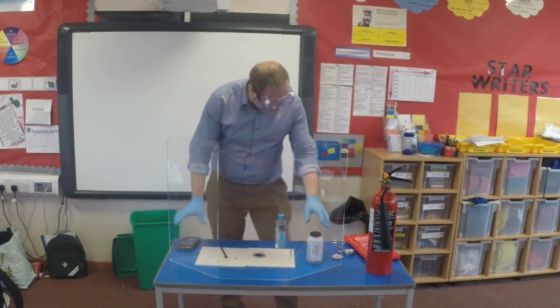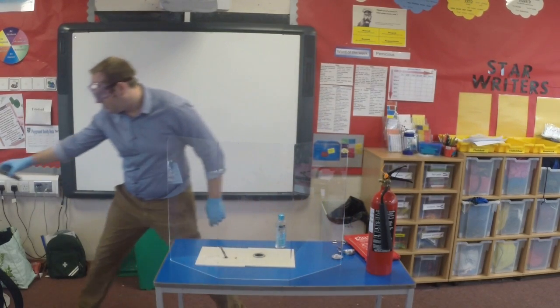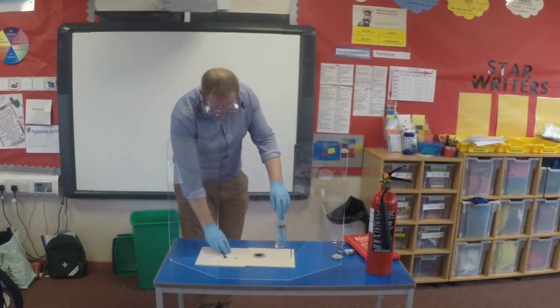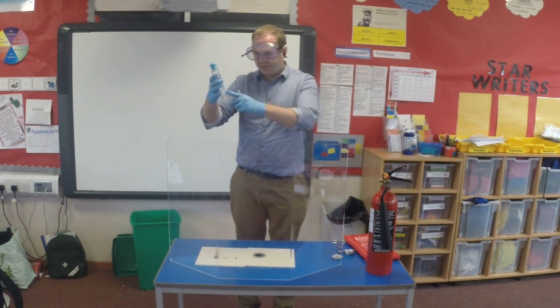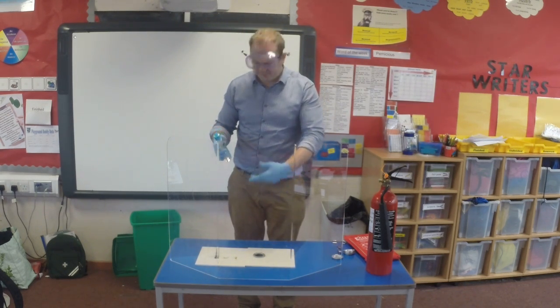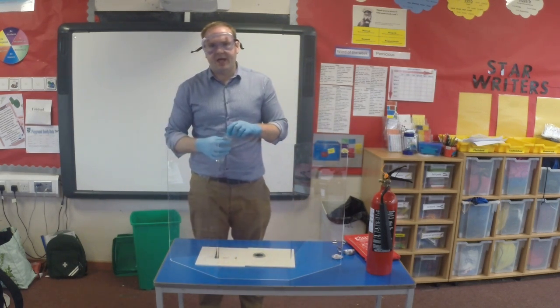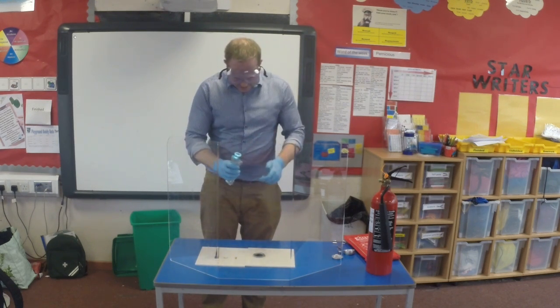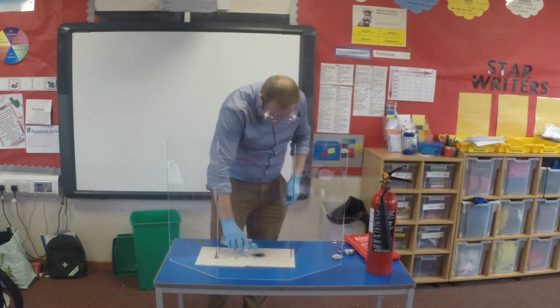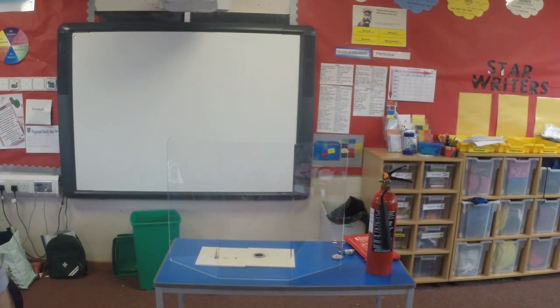Now I'm going to move anything else that's flammable out of the way at this point, including my phone, because I don't want that to have any damage done to it. And now I'm going to pour a small amount, just a few drops of the glycerol into the middle of this depression here, and I'm then going to stand behind the blast screen, and you'll see what happens. A little bit here. I'll step behind. I'll bring the camera up so we can see.